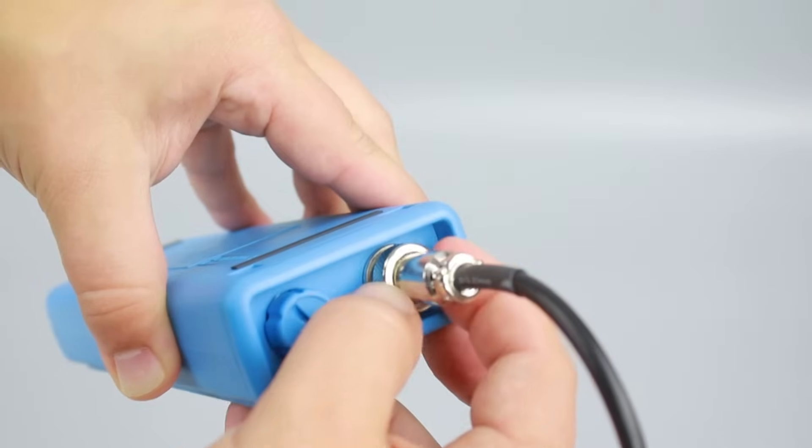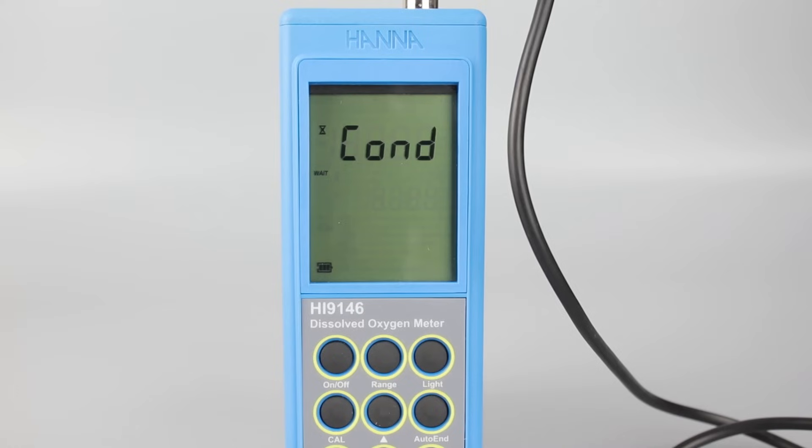Connect the probe into the electrode socket and secure it with the threads. As soon as you turn on the meter, you'll need to wait for conditioning. The probe operates under a fixed voltage, and polarization ensures that we have stable, accurate measurements. Once COND is no longer on the screen, you can proceed with setup.